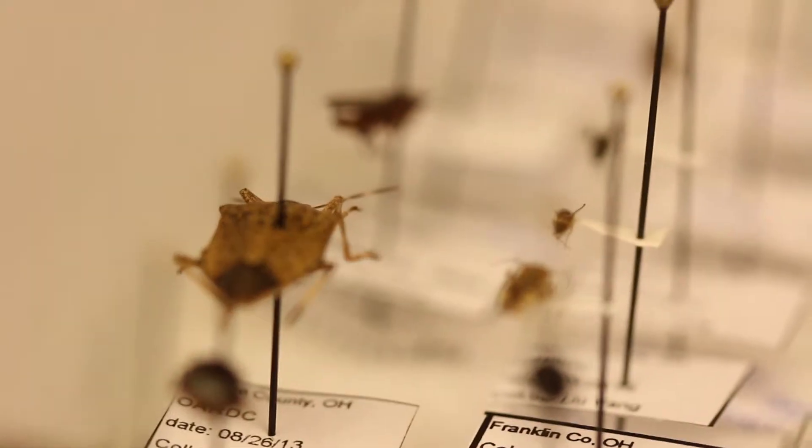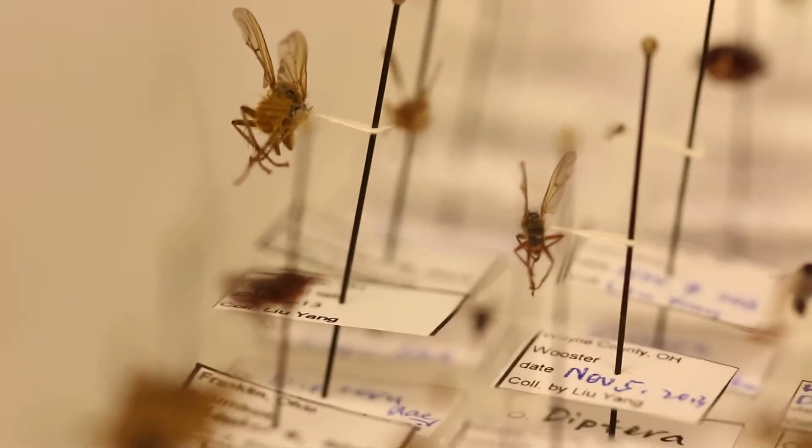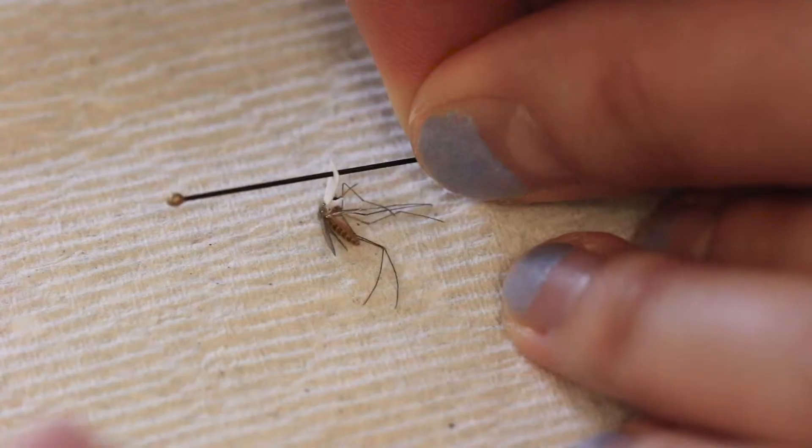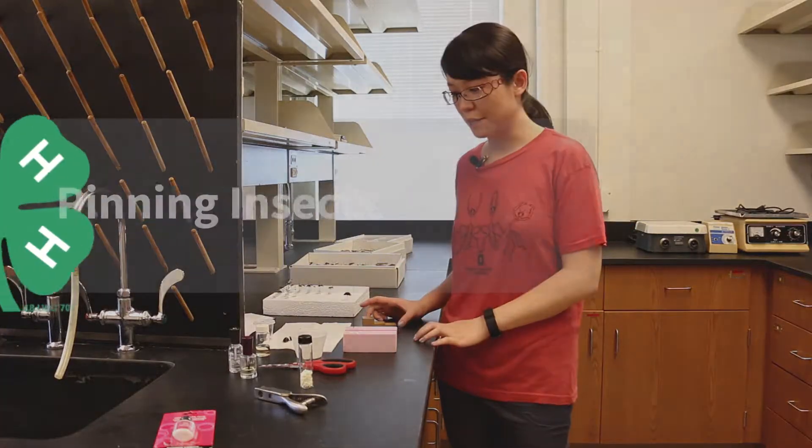There are many kinds of insects and just as many ways to preserve them. However, there are three common ways to make insect specimens: pinning, pointing, and keeping them in a vial of alcohol. So here I'd like to show you these three ways of making insect specimens.